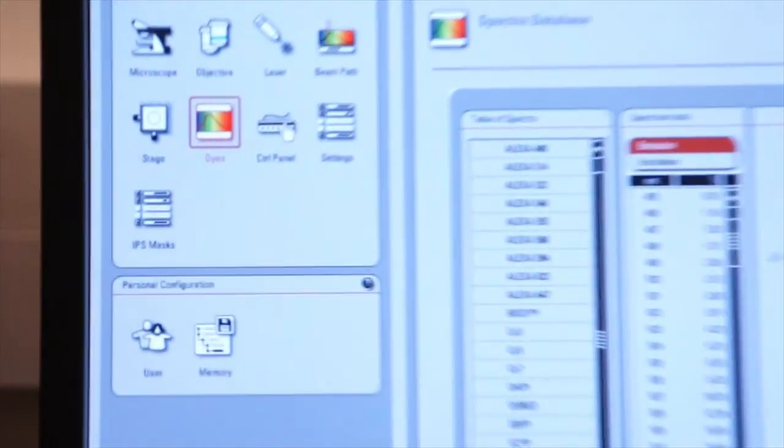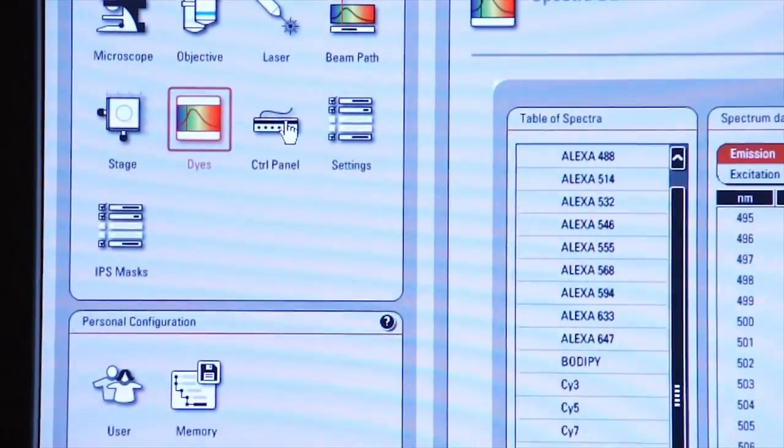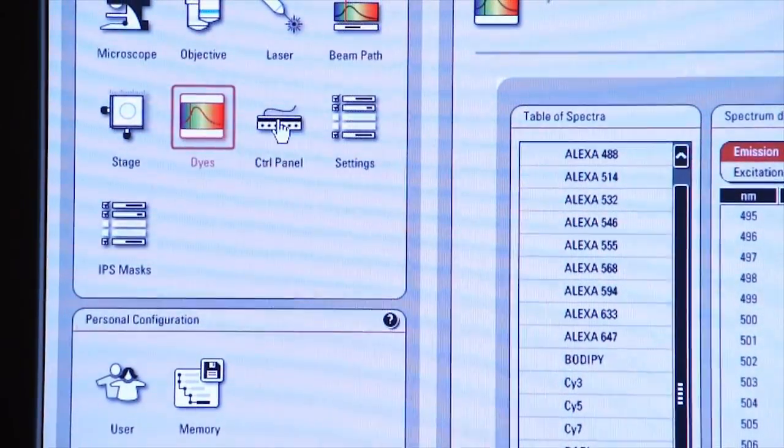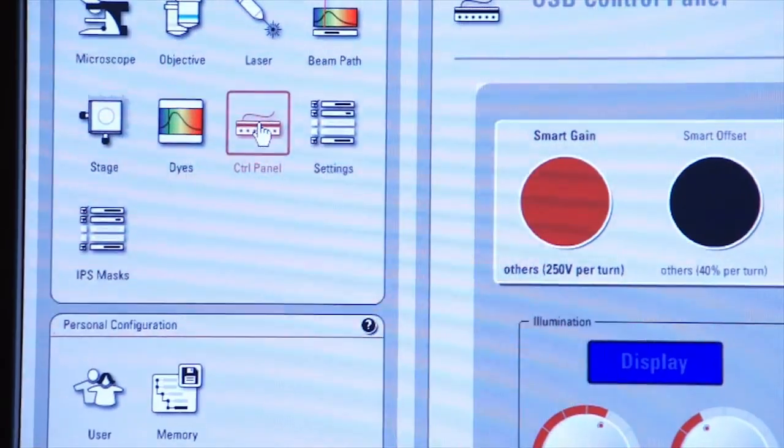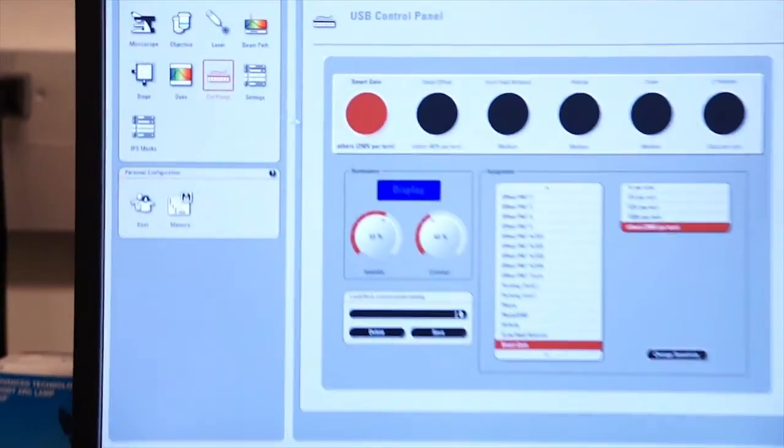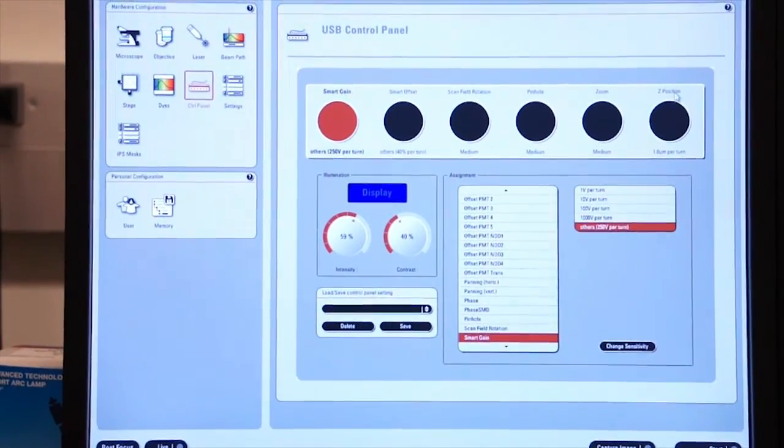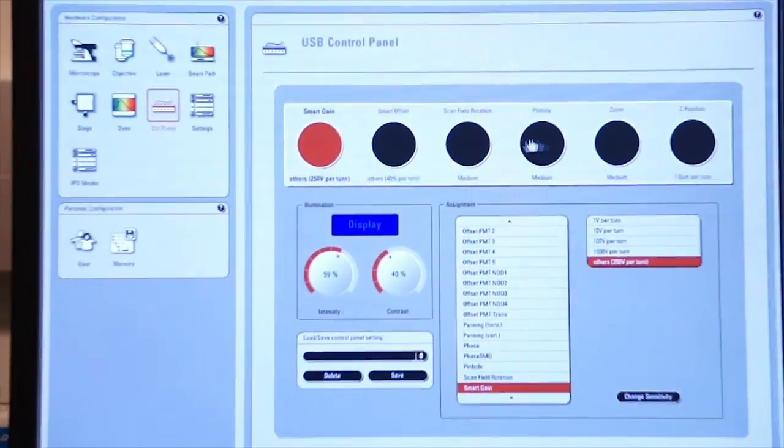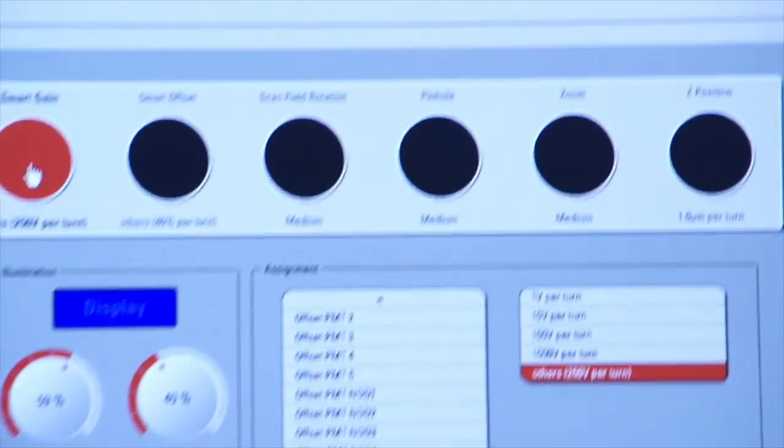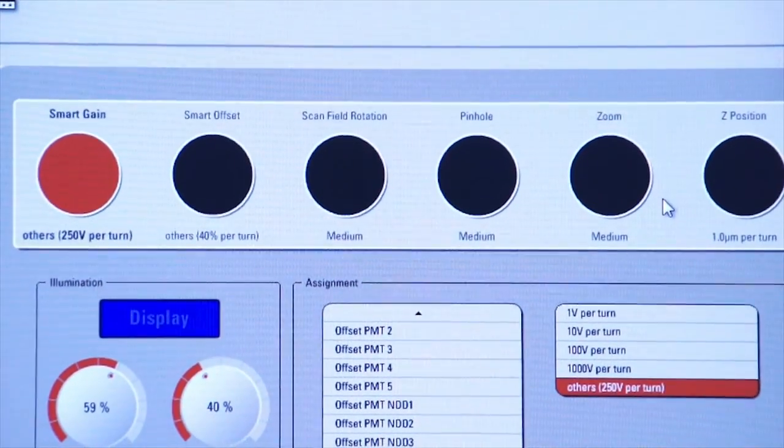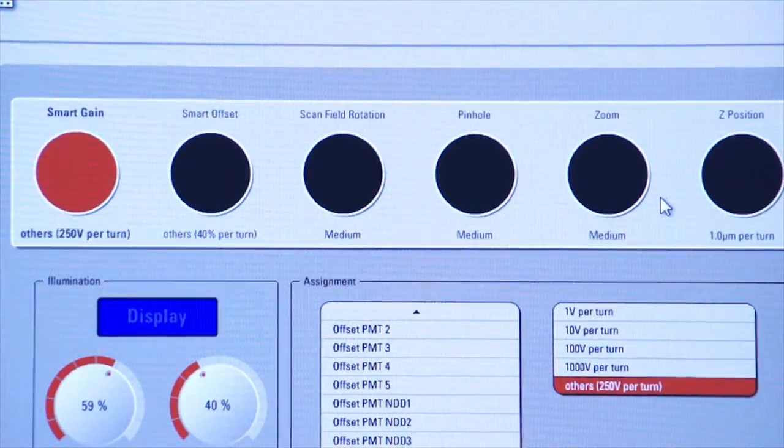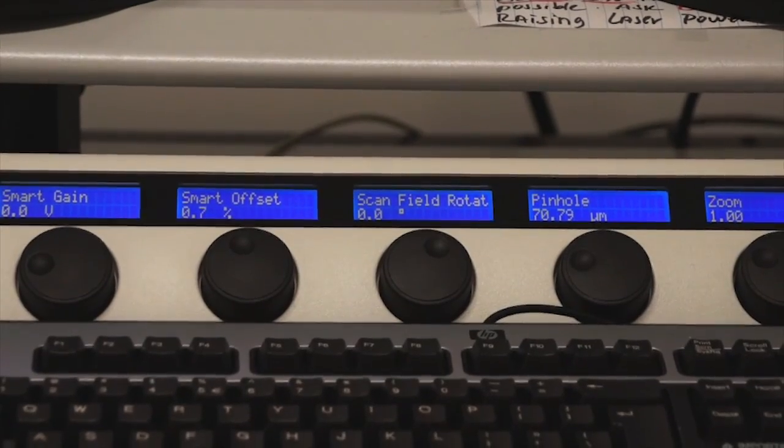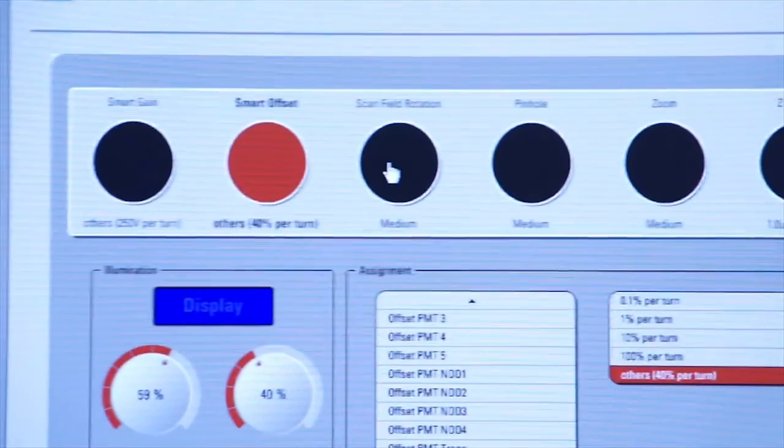Another useful icon on this configuration screen is the control panel icon. If you click on that, you see a rectangle that comes up with a set of circles in it. These circles correspond to the control panel which is on the desktop, and you can see that these are set up for different functions.